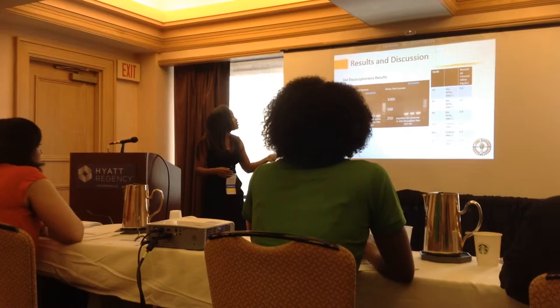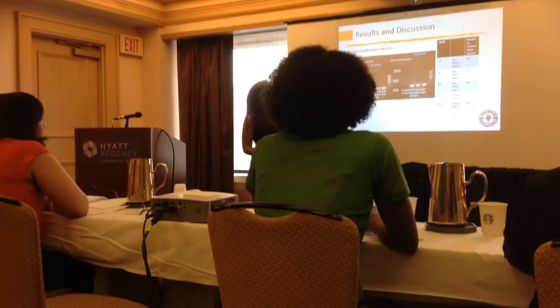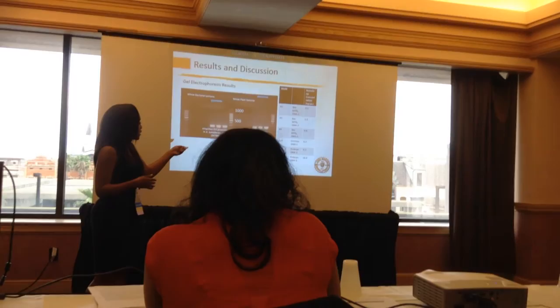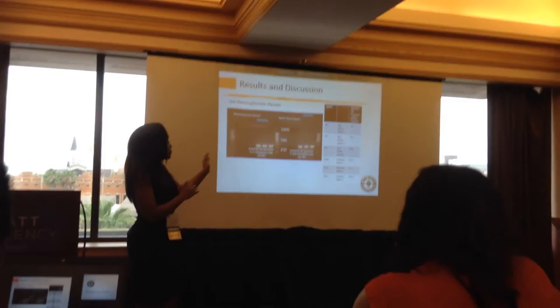And so here's this picture, but labeled. I was able to isolate my whole bacterial genome and extract that DNA. I amplified it using a polymerase chain reaction, which is a PCR. I had a forward and a reverse primer that my advisor and I put together, which was really cool. I went ahead and amplified that and found these amplicons. Once I confirmed that I had my gene inside of my bacteria, I cultivated at that point.